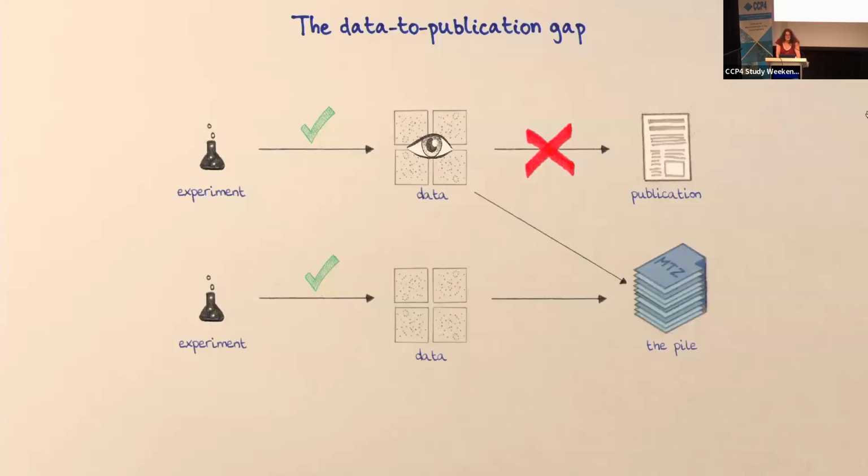So there is a problem which is developing. It's particularly difficult when you're looking at subtle changes in your protein structure. And if you ask any of these researchers, why are you sitting on a mountain of data? Then the answer is usually something along the lines of, well, we can't find the narrative in the structures, we can't figure out the story to write the publication, so it'll just be a bunch of structures with no kind of theme running through the story.